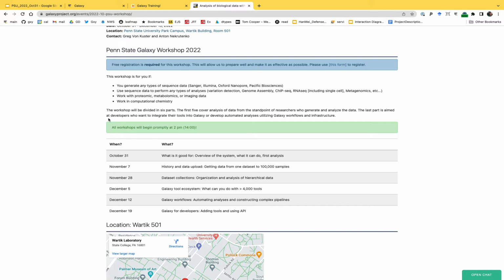So next week, we are going to get some COVID data. I mentioned COVID is a good thing because it has a small genome, but it's applicable to any sequencing data set. In this particular case, this will be Illumina data. But I pointed out that if you have Oxford Nanopore or PacBio, then we can just ask questions. We'll see. That would be a little bit more complex because in this case we're going to analyze lots of data sets. So today we're just going to practice, look at how it works, and so on.